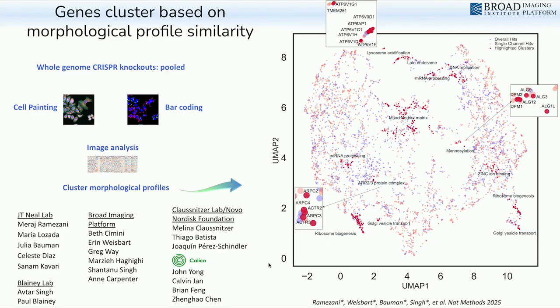I forget, maybe it had like 50 or 100 cells per sample. Because of the barcoding, it's just the limit of the size. We could have done a 4 times or 10 times bigger experiment, but that's the one limitation of this data set. It is publicly available, and we've gotten lots of neat things out of it.